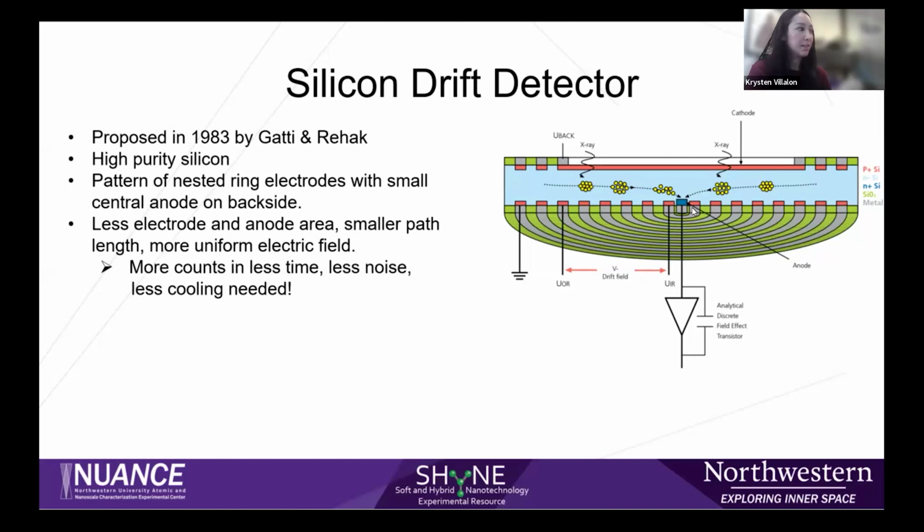So now I can hand this off to Nick, who's going to tell you what happens with cooling, and what we do with that charge that we just generated on our sensor to give us our spectrum in the end.